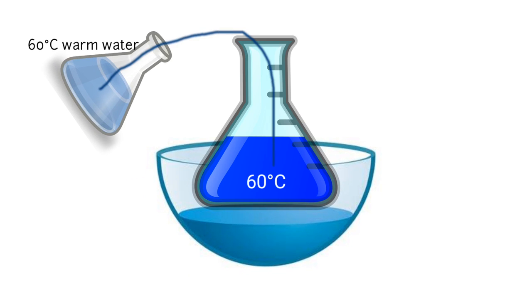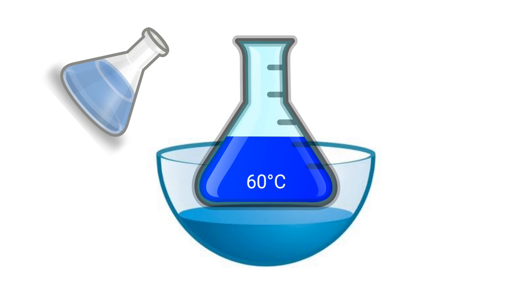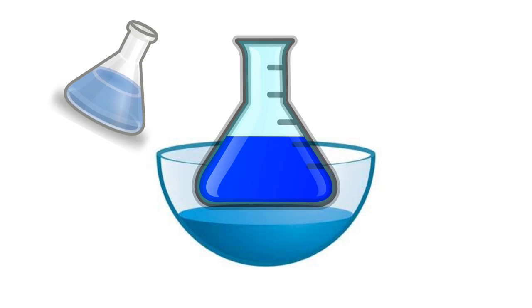The water should only have a temperature of around 60 degree Celsius and it should never be boiling hot. Keep adding water slowly along with constant stirring in the water bath. After a few milliliters of adding water, you will be left with a nice crystal clear blue solution.